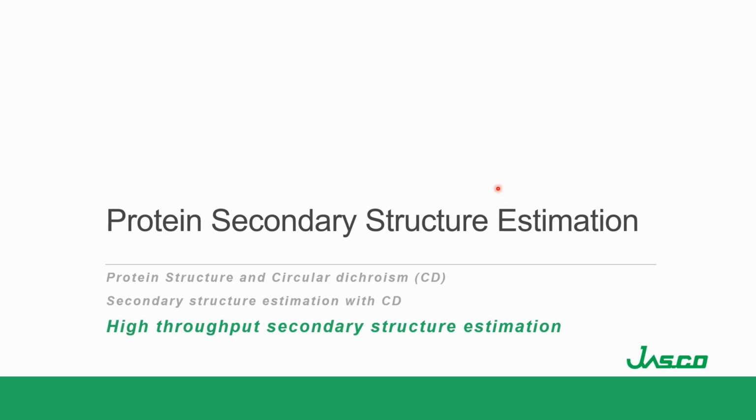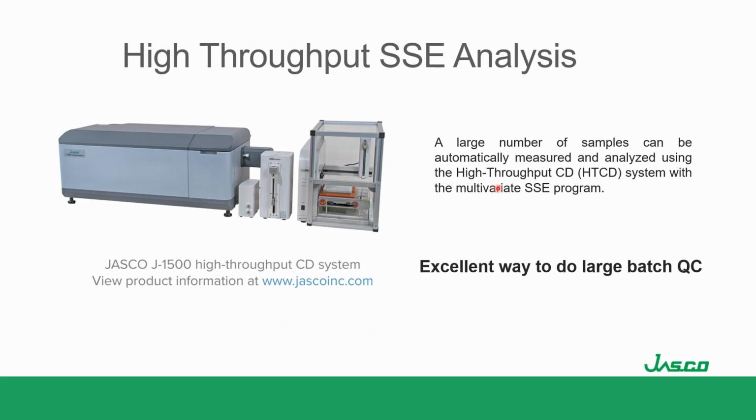So with that description of the secondary structure estimation software, I want to give an example of how this can be effectively used in CD. A large market right now is for very high throughput. If we can do things faster and more efficiently, that's going to be better overall for measurement purposes. So with high throughput systems, we can measure a large number of CD samples.